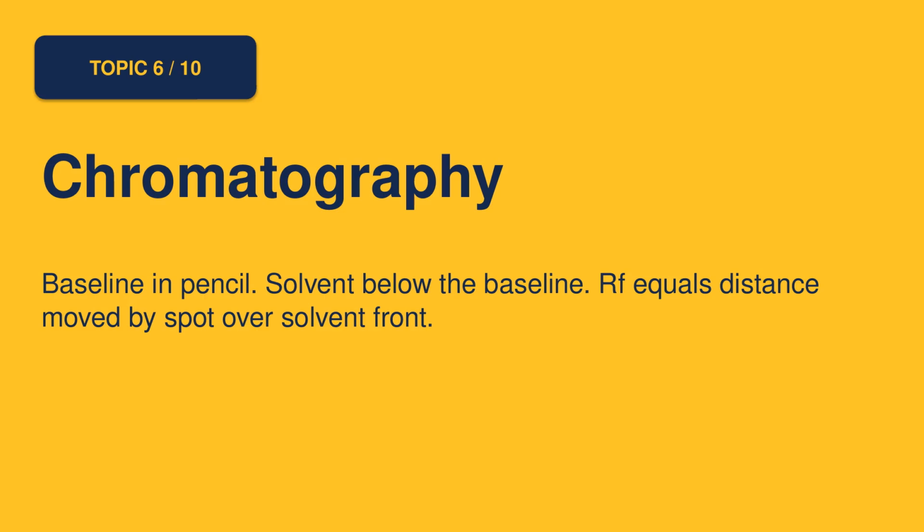Baseline in pencil. Solvent below the baseline. Rf equals distance moved by spot over the solvent front.